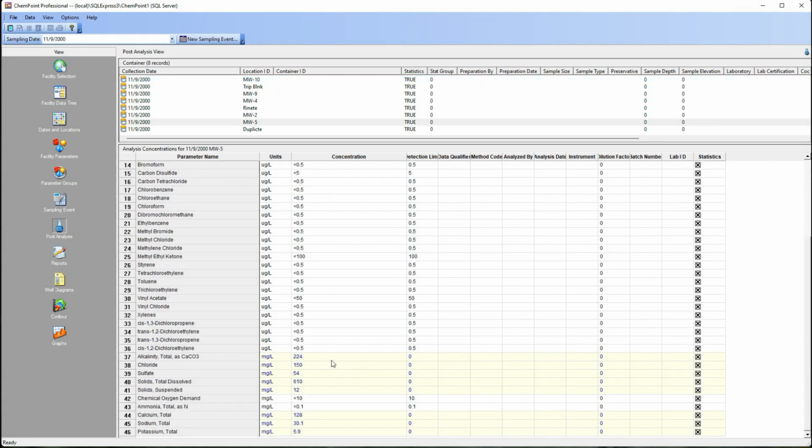Detected values are going to be highlighted in yellow. One of the things you really want to check is make sure that your detected and non-detected values came in correctly. Some of the most common mistakes are that everything comes in as detected, or everything comes in as non-detected, or everything comes in as 0. And that means you configured your analysis data map incorrectly on how you're specifying non-detects.